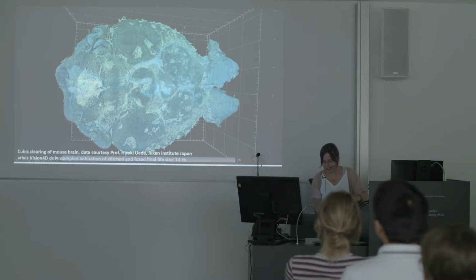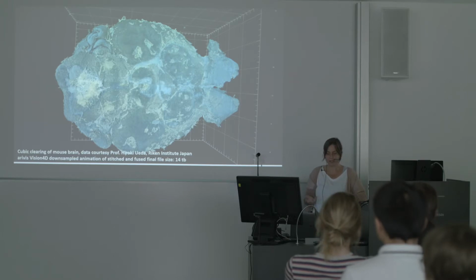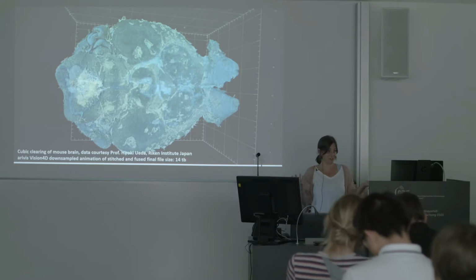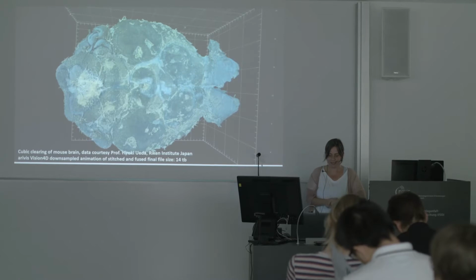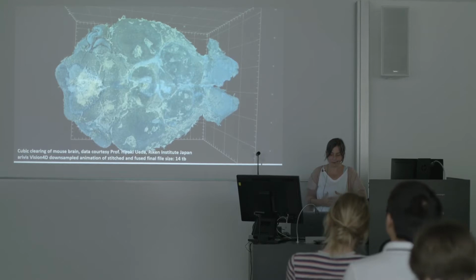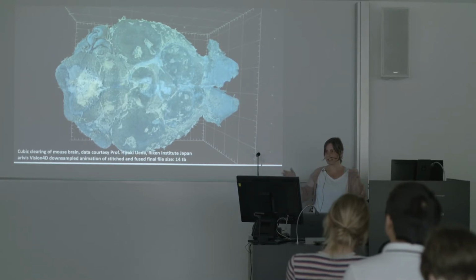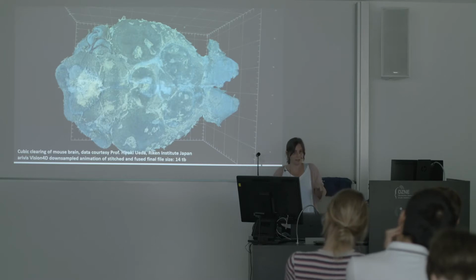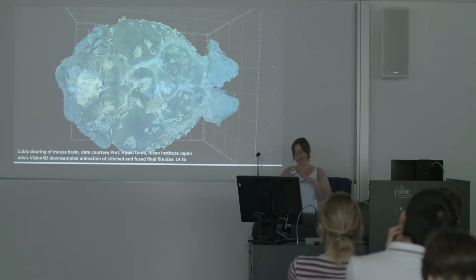So this is a nice movie from Hiroki Ueda's group. Ali has mentioned it before. We asked for it as a proof of concept a year ago, as we did not have access to such large files yet. Now our customers are generating many terabytes of data. At that time, the Ueda group was kind enough to provide us with a large set of small pieces of volumes, altogether 14 terabytes, shipped from Japan to Rostock, where our engineers are located.